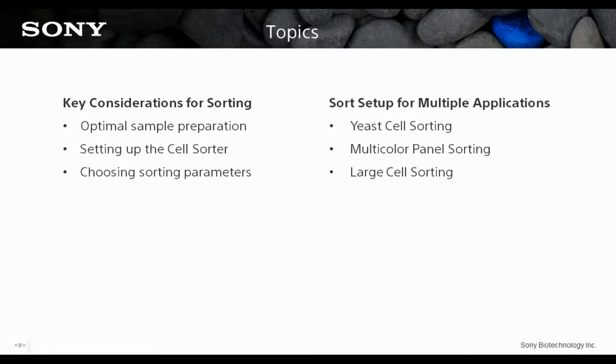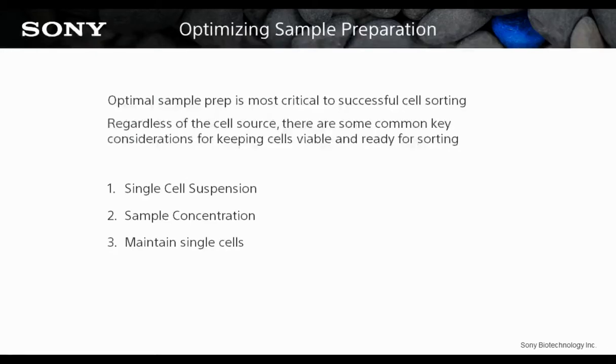We will review how a user can set up a cell sorter using a streamlined approach, and what the sort parameters are that should be chosen during sort setup. In the second half of this webinar, my colleague Miro Koulnis will do a deep dive on setting up multiple applications using diverse samples, sharing with us how these can be set up seamlessly on the same instrument in a multi-user lab. Let's get started.